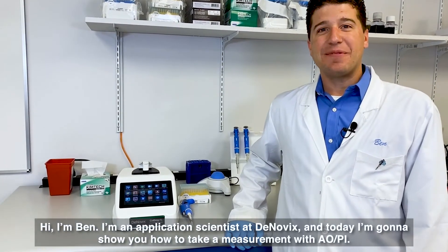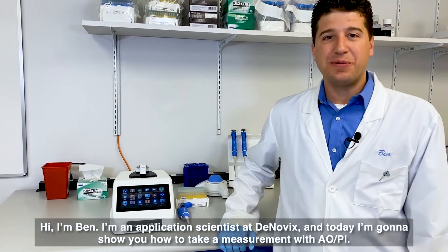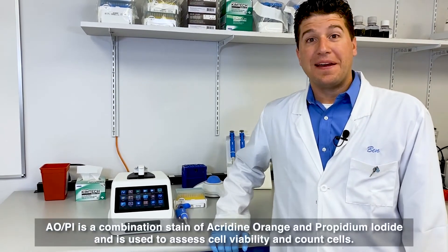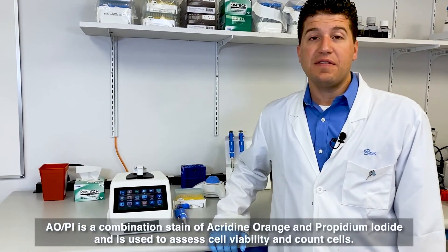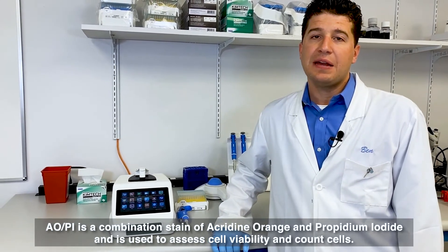Hi, I'm Ben. I'm an application scientist at DeNovix, and today I'm going to show you how to take a measurement with AOPI. AOPI is a combination stain of acridine orange and propidium iodide and is used to assess cell viability and count cells.